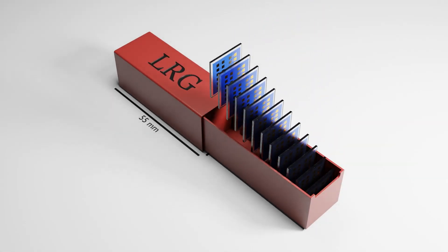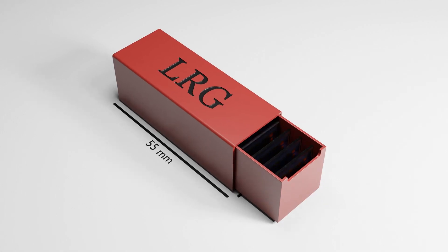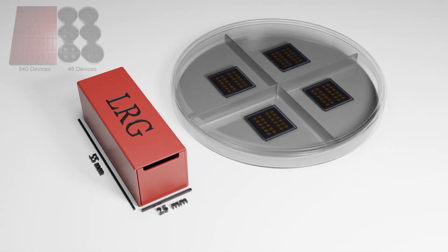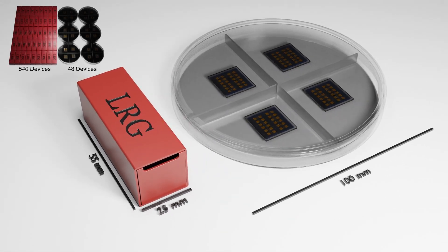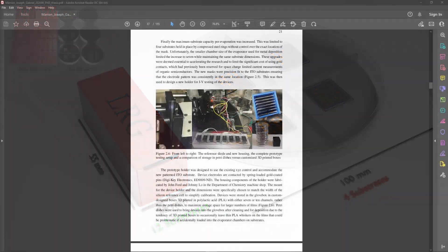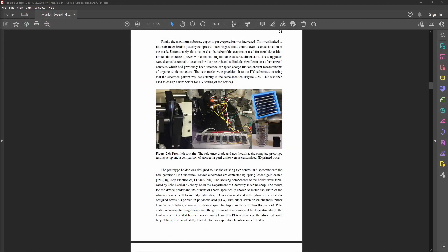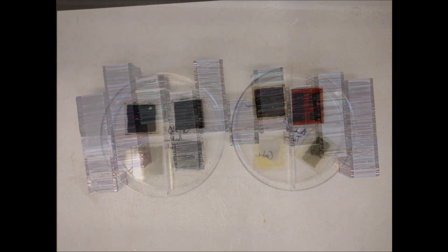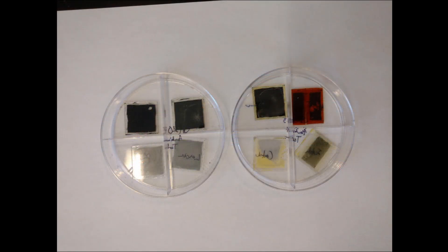During my PhD, I worked with thin film devices — mine were solar cells. In my current job, the group works with transistors and capacitors, but this design would be useful for OLEDs or really any thin film, microscope slide, or even coverslips. All of these, or at least the ones I worked with, were typically made from ITO coated glass slides or chips cut directly from silicon wafers.